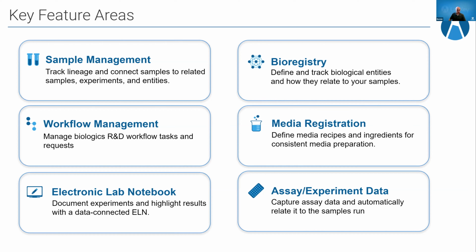Then there's our electronic laboratory notebook, which I mentioned a little bit previously, that speeds up your documentation of experiments through an intuitive and data-connected interface. As I mentioned before, use of all of our other data capture and data relationship mechanisms allows you to quickly enrich those notebooks through direct data referencing without, this is the important part, having to compile that information again.